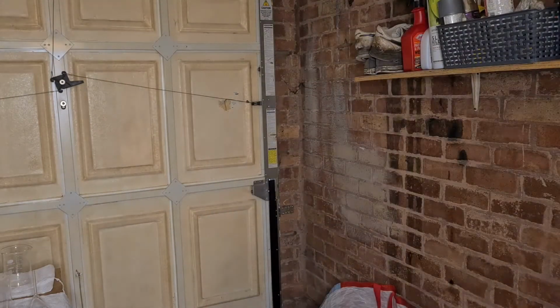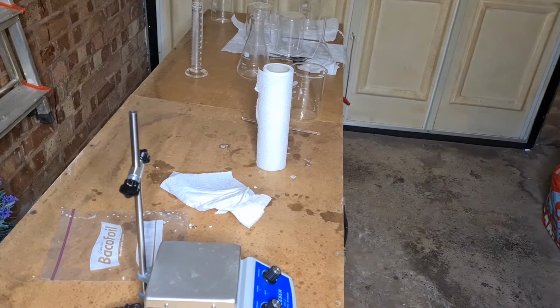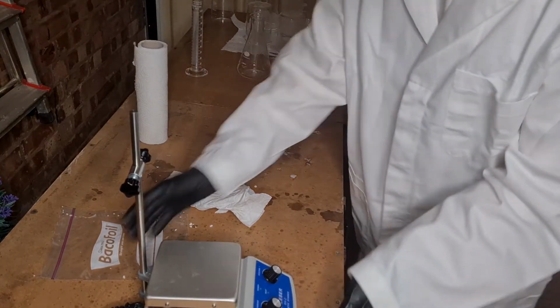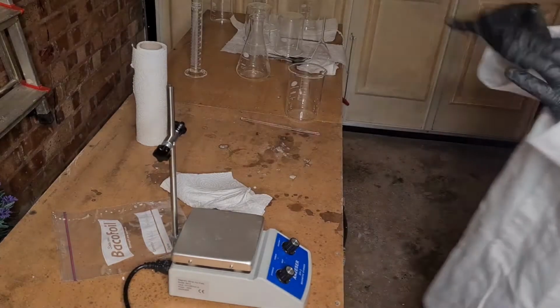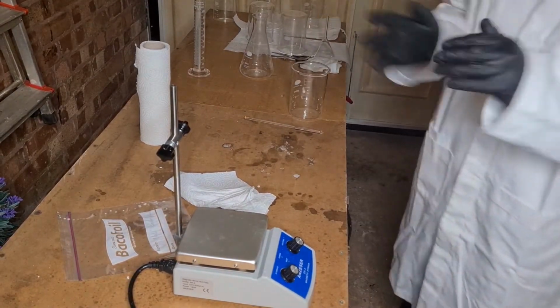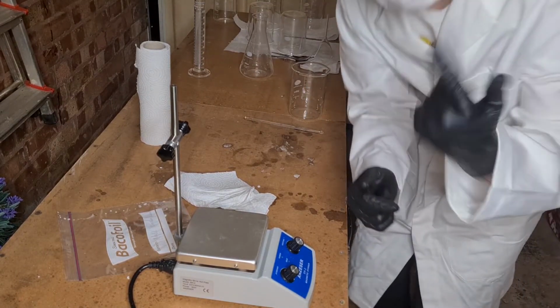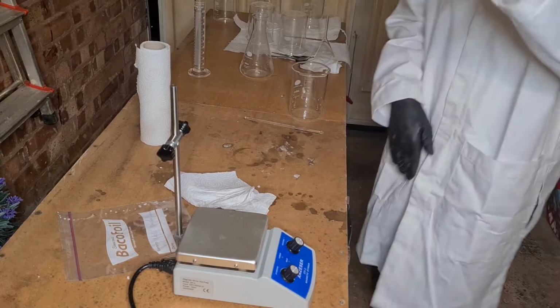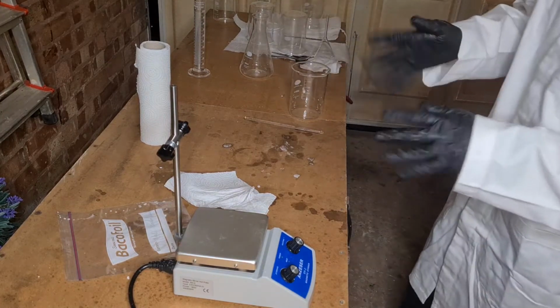So, as you can see, there is the lab in all its glory, or lab. So we have a hot plate right here with a stand on it that I don't need. It's simply there for effect. Also, before I get into it, I should probably mention the PPE. So I'm wearing these nitrile gloves, these goggles, and this mask, and a lab coat. Now, 3 of those are required, I would say. One of those is for dramatic effect, although we won't admit that one.